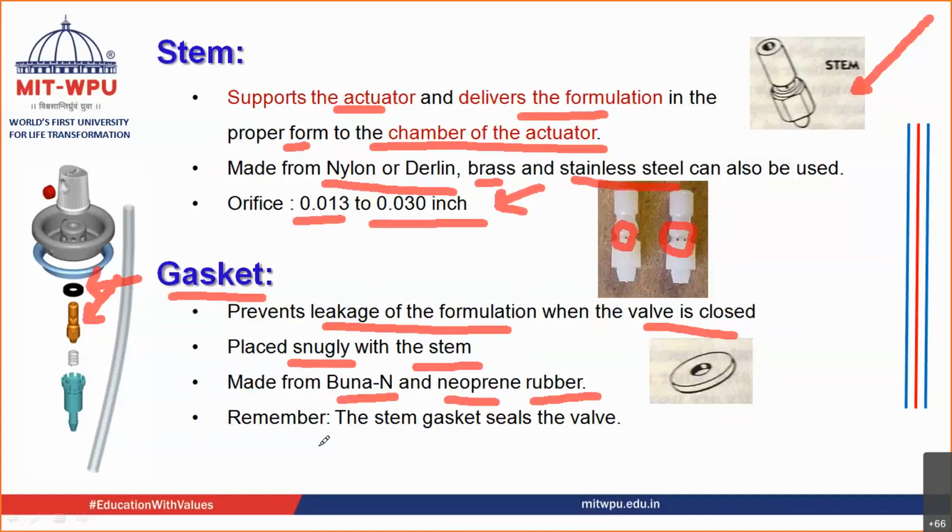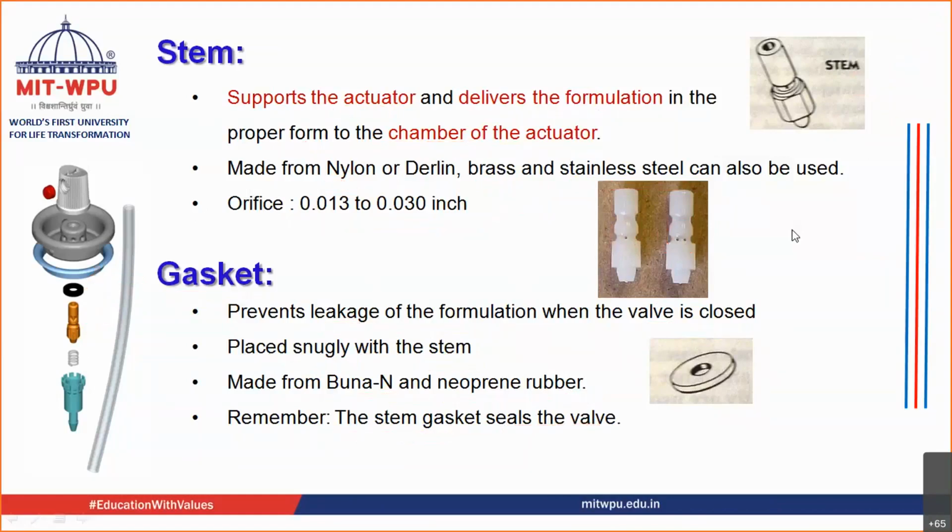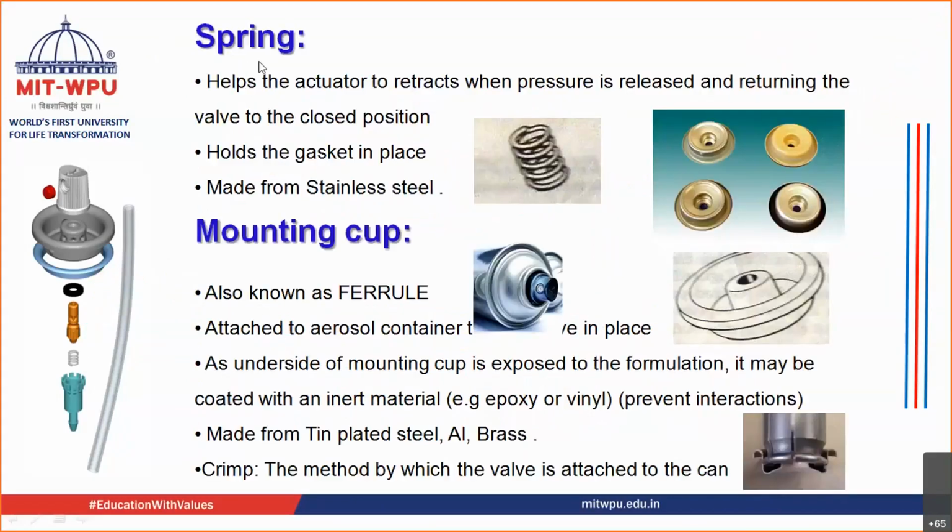You have to remember that this stem gasket seals the valve. The valve is sealed by the gasket, right? Understood? So this is the third part, that is the gasket. Moving ahead, the next part is the spring.